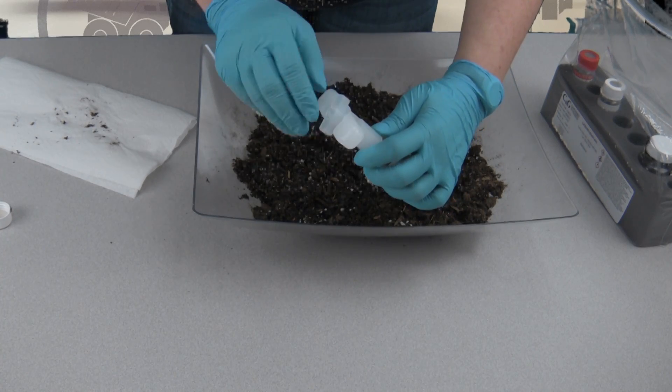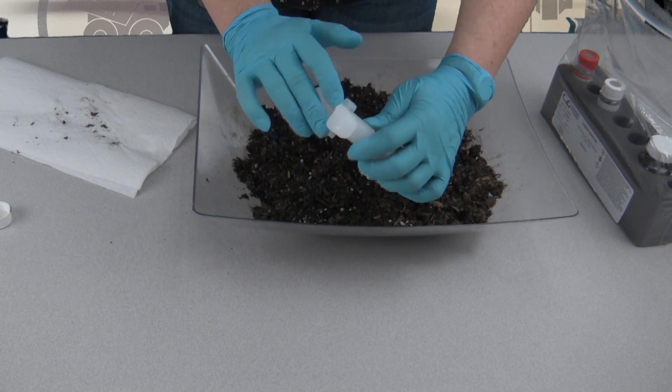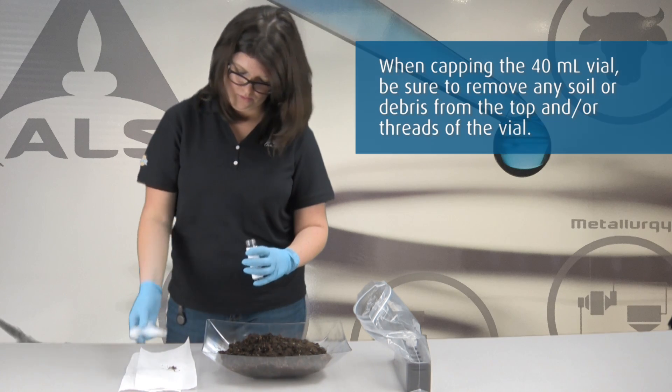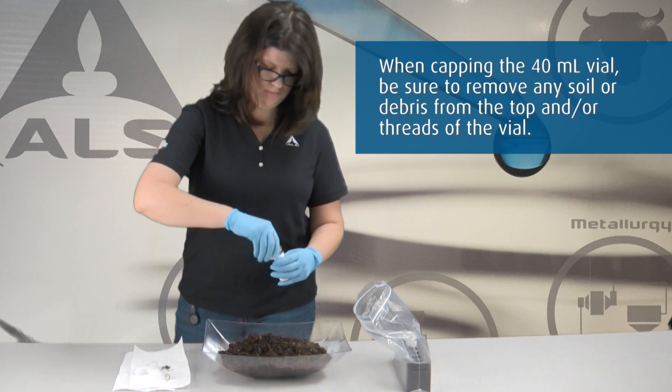Rotate the plunger 90 degrees until it is aligned with the slots in the body. Extrude the sample by pushing the plunger down. Quickly place the lid back on the VOA vial.